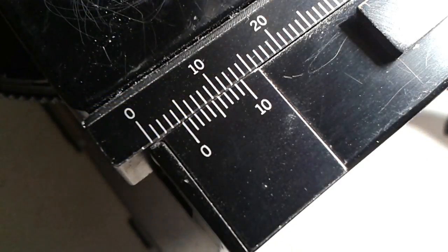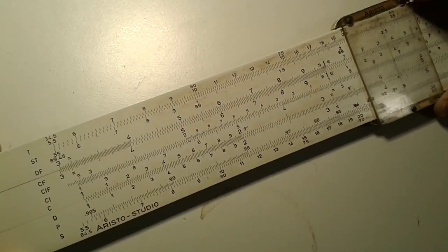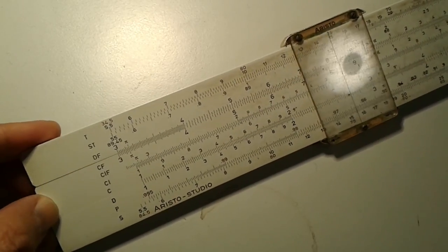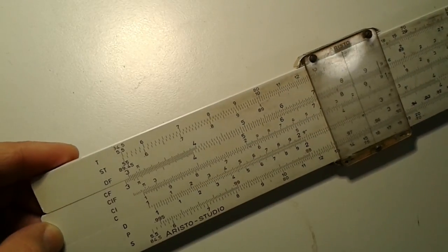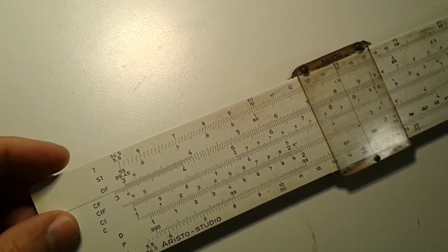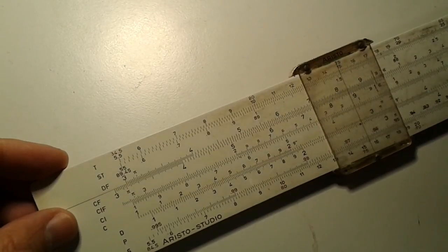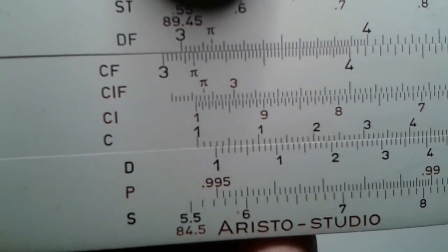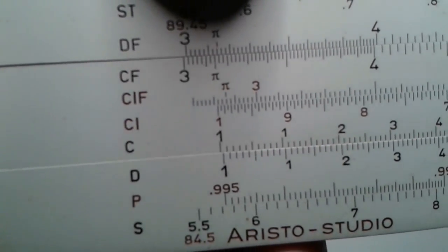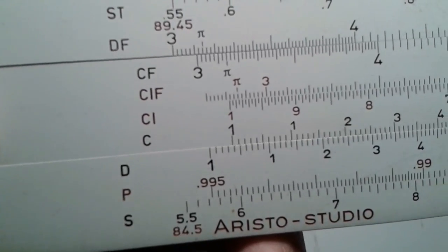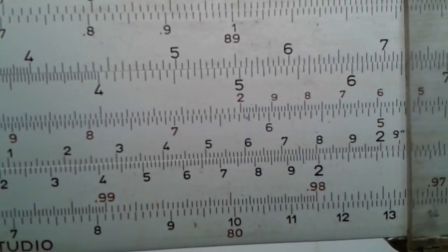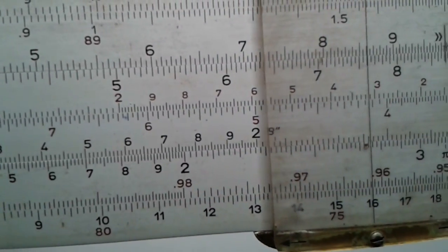So that is basically a short introduction. This is not a new concept. This is a so-called slide rule. They're not used anymore obviously, but before the advent of digital calculators people used those slide rules to actually make calculations. And it's using a similar principle. You have to basically align two different scales and sometimes the scales, the lines are shifted against each other. So the concept is nothing new here. It's been around for quite a long time.